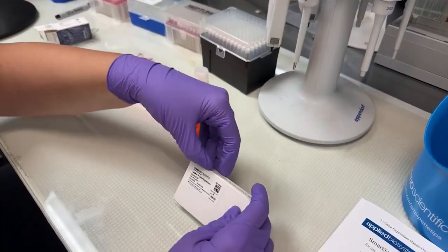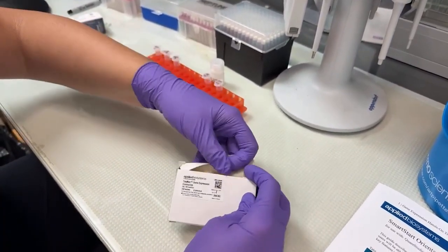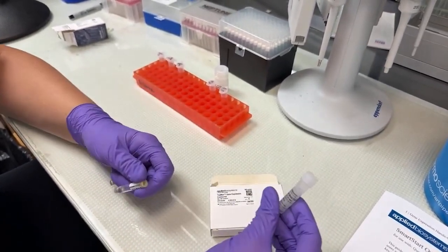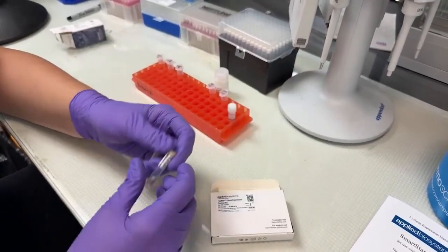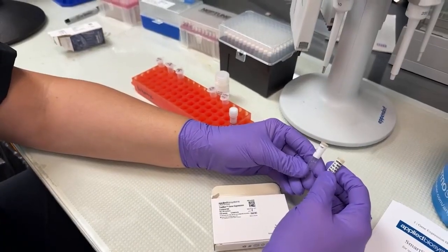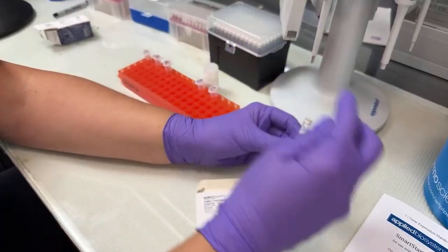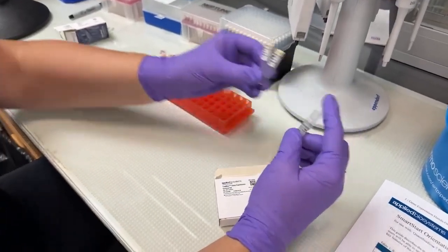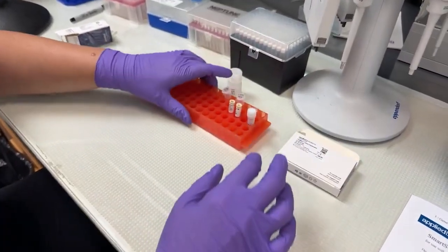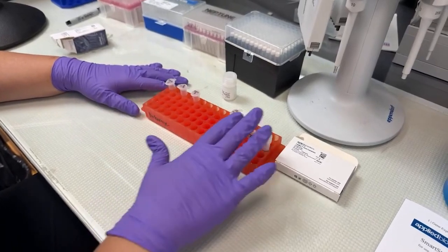Our TaqMan Gene Expression Control Kit comes with 3 items, which I will open for you. That comes with 1 control sample and 2 assays. So we have 18S and a TERT assay, both for human RNA, and then we have our sample of the human RNA. What I'm going to do when I first start is vortex everything that had been on ice, which were these 3.